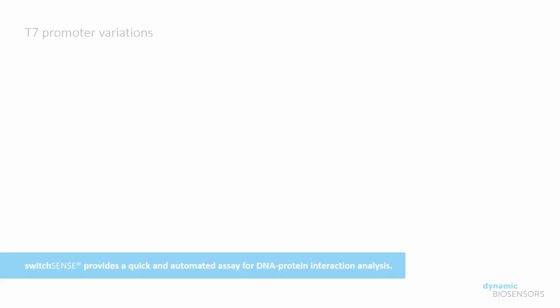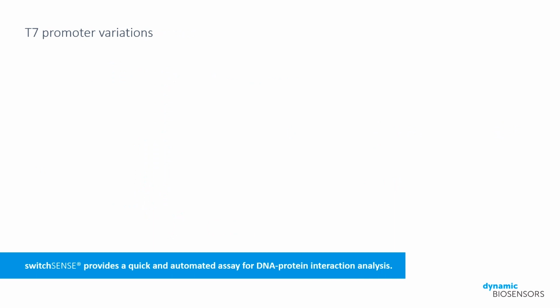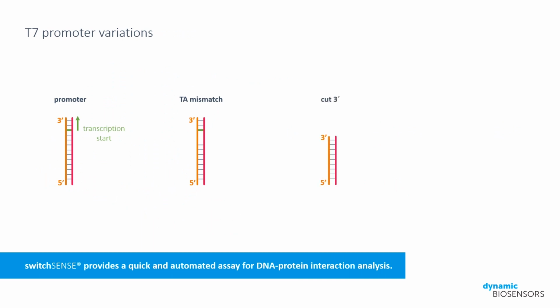sequence can be confirmed. For this purpose, let's pick one sequence of each type of modification in addition to the consensus promoter sequence. The consensus core target sequence is flanked with upstream and downstream regions and serves as our reference and positive control for the T7 RNA polymerase batch used. We will include a sequence with a 2-nucleotide mismatch in the TATA box, as well as a sequence lacking the TATA box and downstream template completely. Thereby, we can separate binding affinity from unwinding of the template, the second step of the polymerase activity.